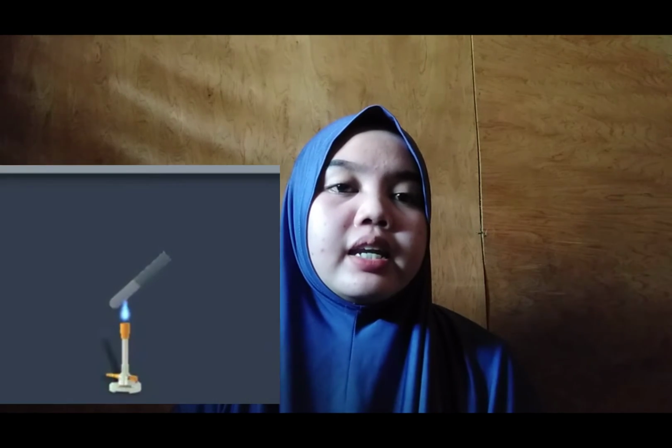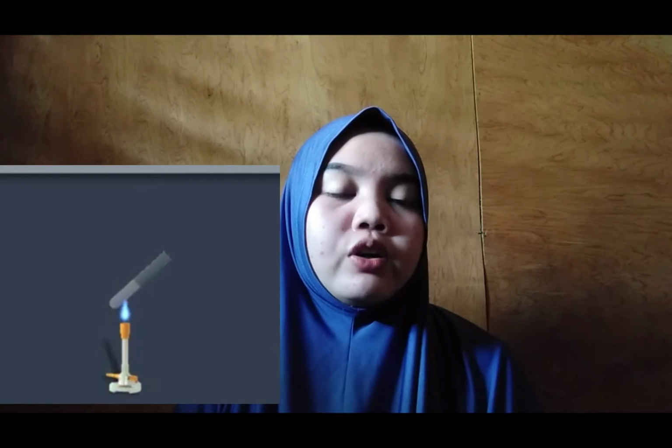The last is the color test for protein. We have 6 tests, which are the Ninhydrin test, Biuret test, Xanthoproteic test, Millon's test, Hopkins-Cole test, and sulfur test. Since we have 6 tests, we also have 6 procedures. Procedure in the Ninhydrin test: take 3 ml of aqueous solution of egg albumin in a test tube, then add 4 drops of Ninhydrin solution to it. Then heat the test tube and observe the color that appeared.